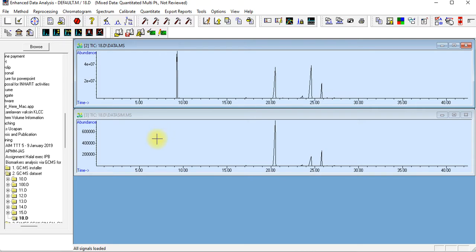If we want to establish a calibration curve, we only use sim mode data. This is the lacking in the laboratory services, where they don't disclose this to all of us. So you have to know which one is the best.